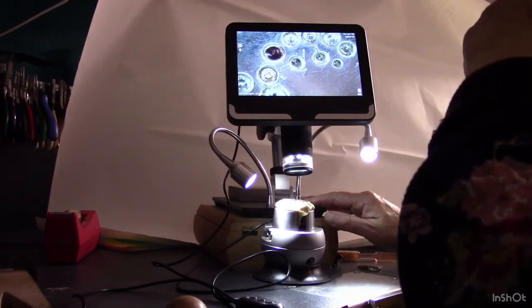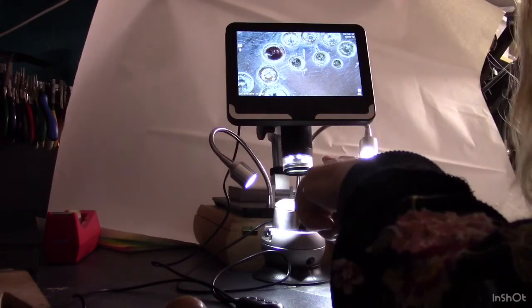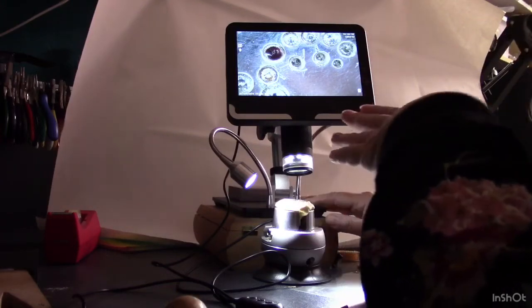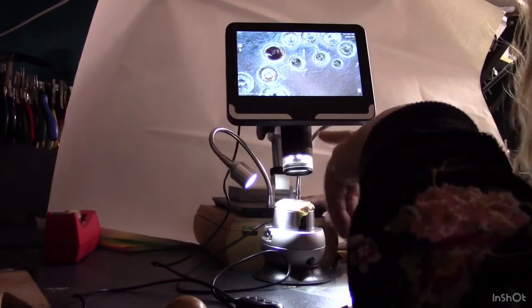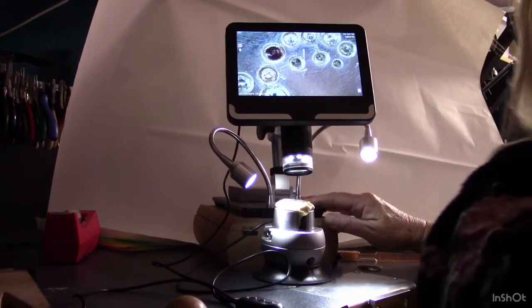So I can do stuff under this microscope. It has a little SD micro card in it and I can record stuff. Well, I haven't quite figured out how to do that yet, but I'm going to because I think it will help with my video journey.